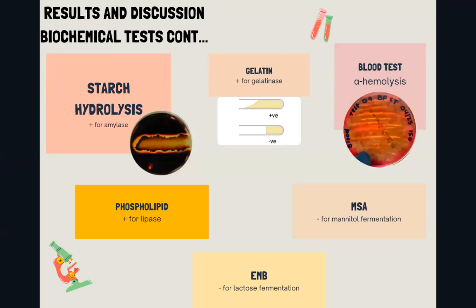For our starch hydrolysis test, we flooded our agar plate with iodine. And when we did this, our bacteria had a very big clearing, meaning that it was positive for amylase hydrolyzation.